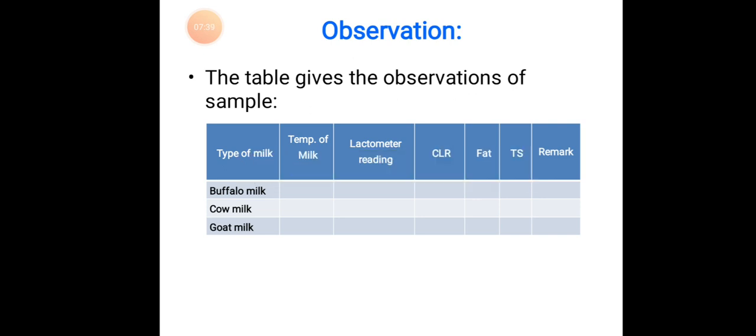Thank you very much for your patience in listening. These are the different tests which we conduct for various milk samples, so that we can get the proper values for milks such as buffalo milk, cow milk, goat milk, etc. Thank you for your patience in listening.